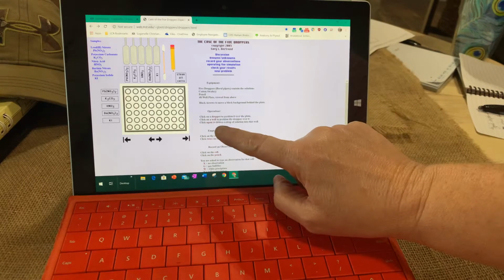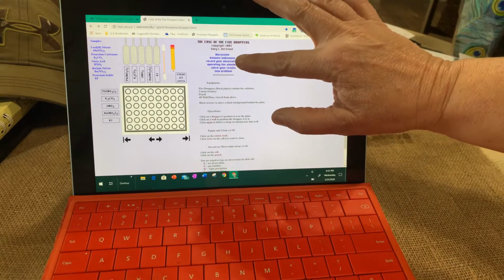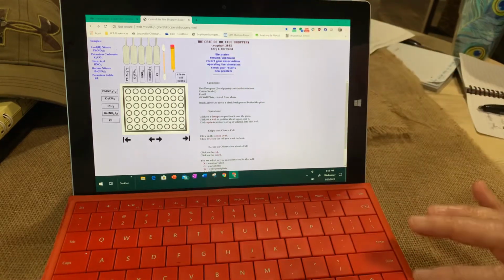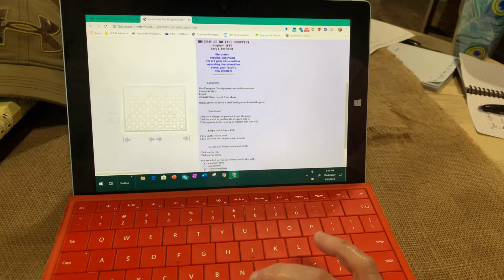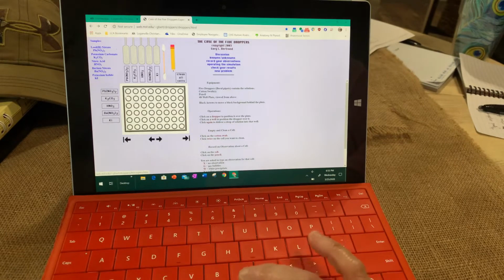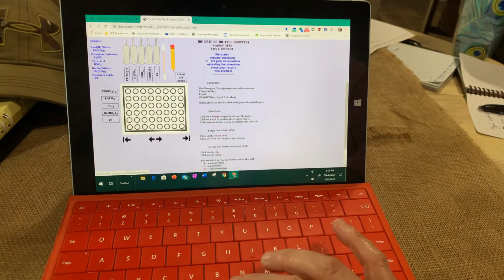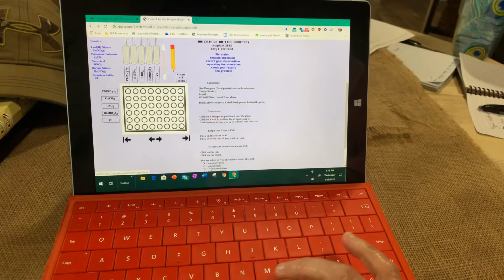And so just a couple of things to talk through. If you notice over here on this side, you've got a couple of different steps that you might need throughout the scientific method. You've got knowns and unknowns. Okay, and we're going to start off with these solutions. So just make sure that they're all labeled when you're going through. And then on the steps that you see over to the side, for this one, you'll notice this is lead nitrate.